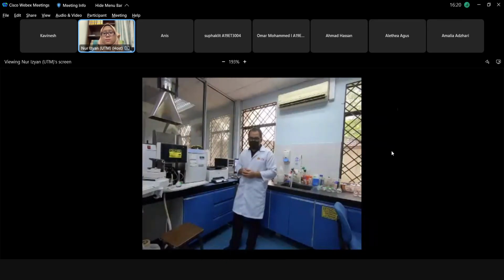the sample. The technique can be used to analyze the concentration of over 70 different metals in a solution. It uses absorption or emission spectrometry to assess the concentration of analytes in samples.